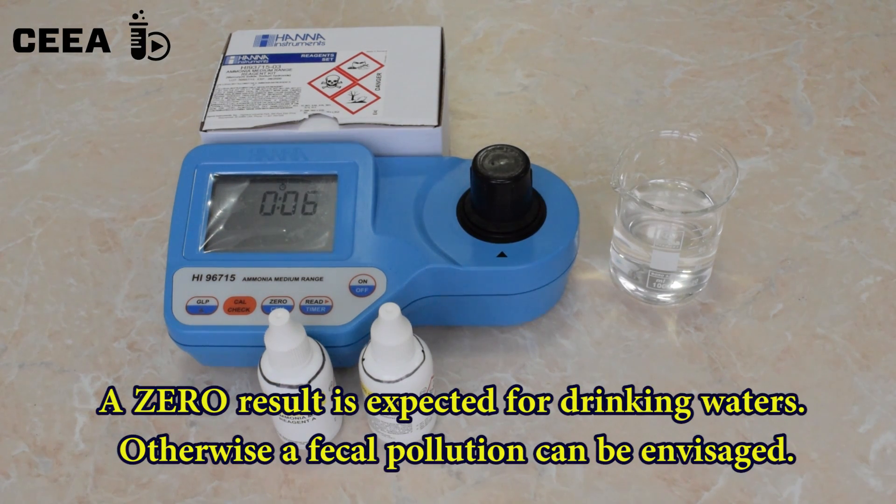As we expected, the result is negative. There are no ammonia in the analyzed water.